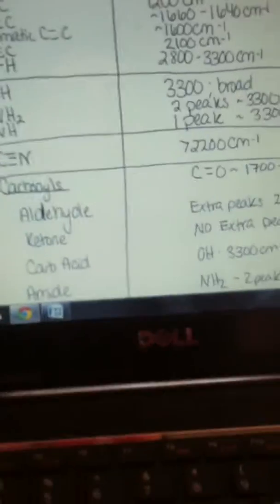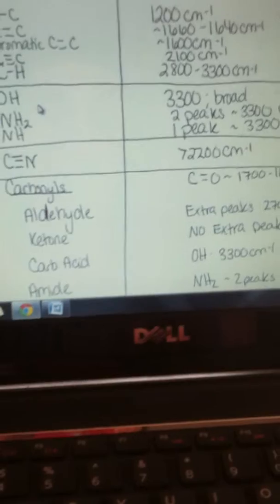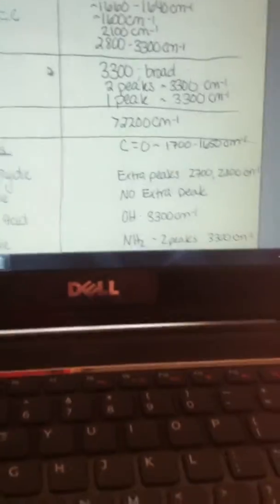I didn't really see, it doesn't do any carbonyls. We didn't have anything at the 1700 range. So carbonyls were out. We didn't have any oxygens in here, so that also excluded any type of alcohols in there. So then that kind of narrowed it down a little bit.